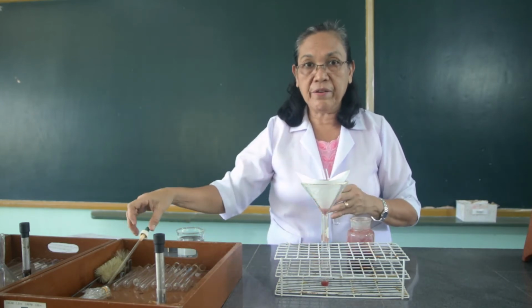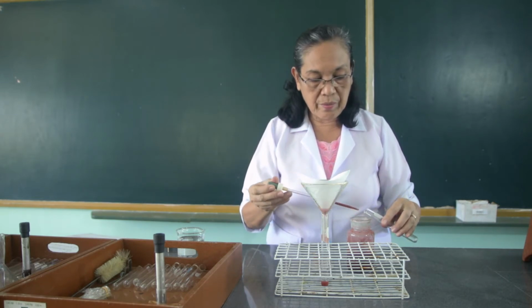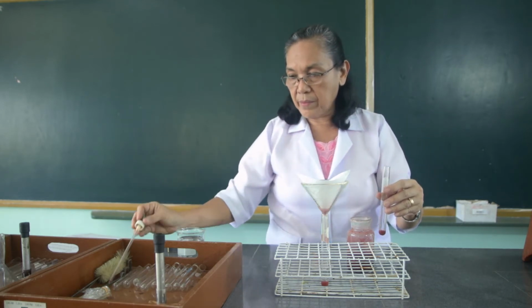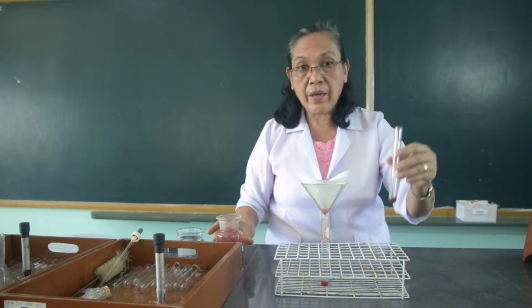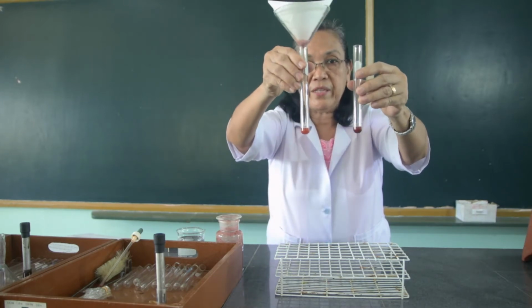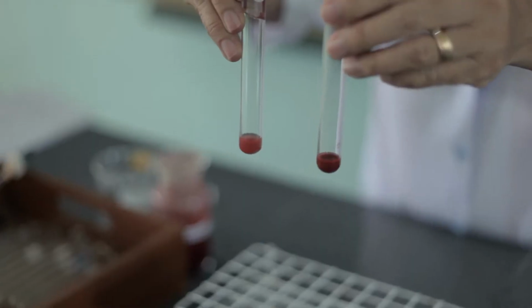So for the sake of comparison, I would like you to compare these two. The unfiltered one, this is the unfiltered one, not being filtered, and this is the other one which is filtered. Observe.